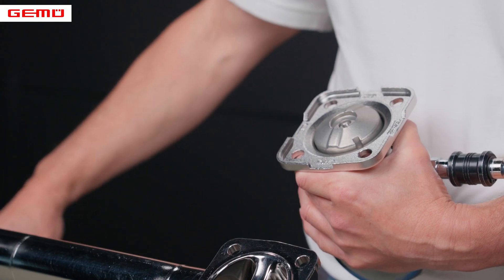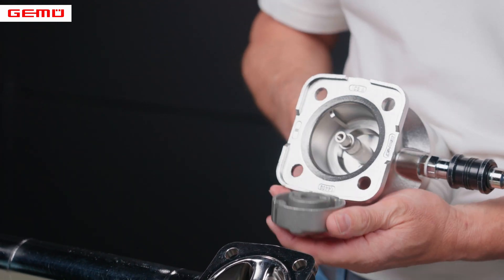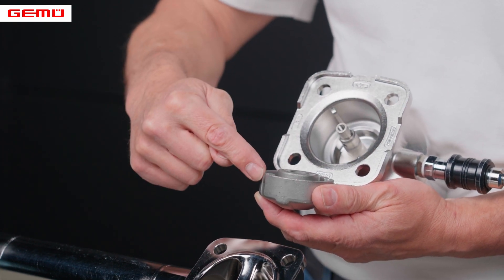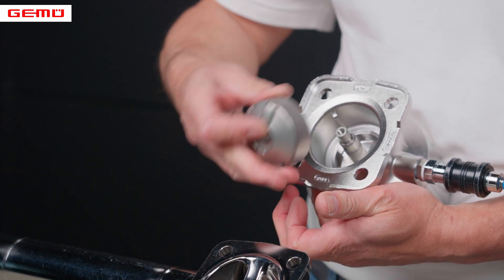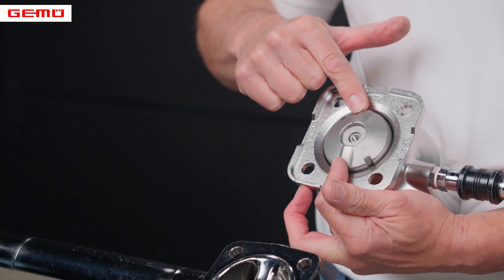Since the compressor can be removed, make sure when reassembling that it is inserted correctly again into the guide. This secures the compressor in the correct position, whereby the orientation of the seal contour correctly aligns with the sealing weir of the valve body.